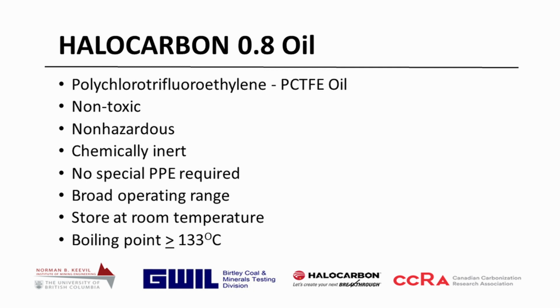It has a broad operating range that's suitable for all the SGs that we would use in the coal lab. You could store it at room temperature, it doesn't evaporate, and its boiling point is pretty high at 133 degrees Celsius.